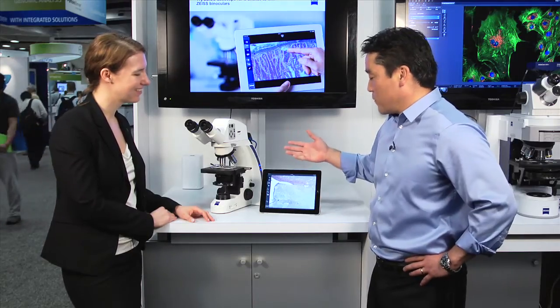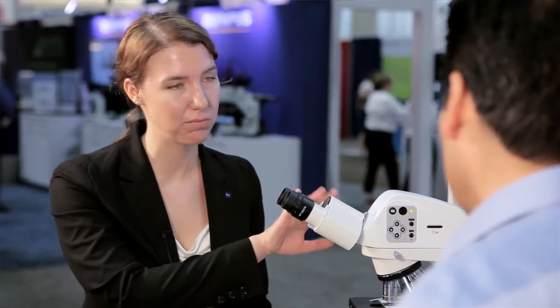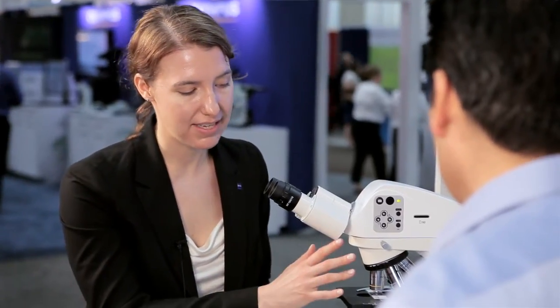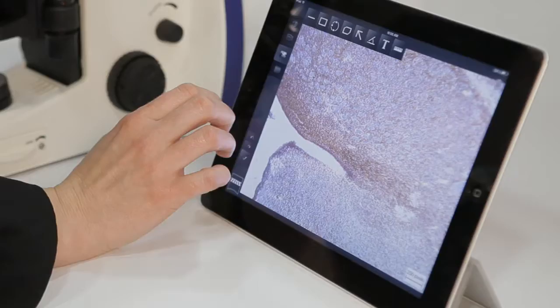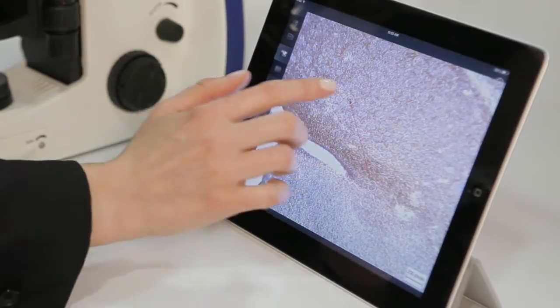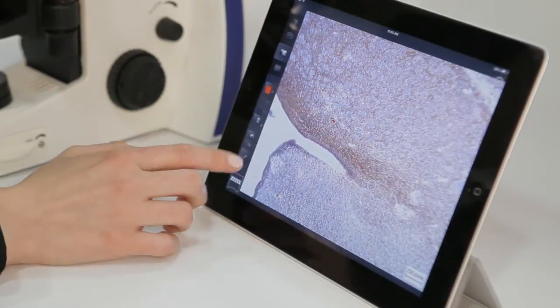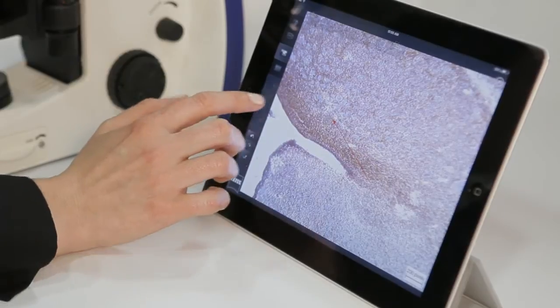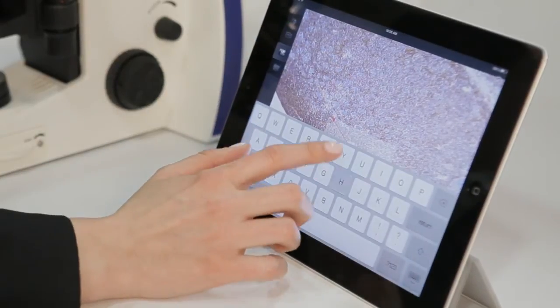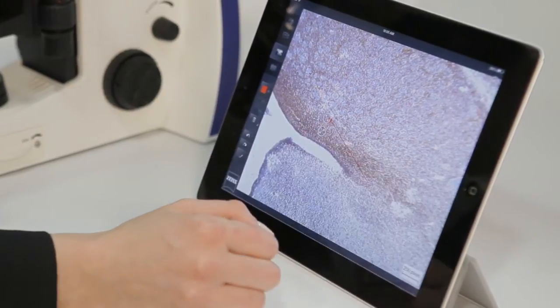What are some of the other features of the app? The app works with both the PrimoStar HD as well as our Axiocam ERC-5S, which is one of our new cameras that you can use on any Zeiss microscope. It can take images, it can take videos, and you can also do annotations — you can add pointer arrows, put text on the images, and save the images directly to your tablet. You can put it onto the SD card, share it with the network, or email the images.